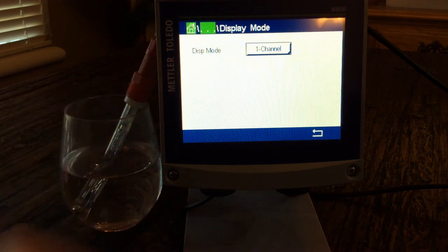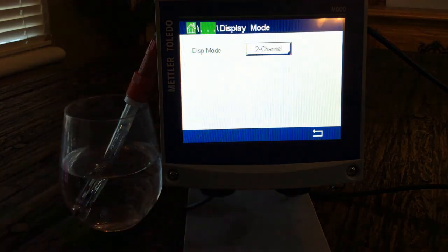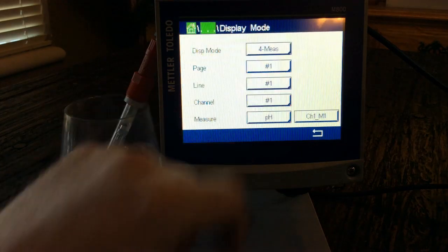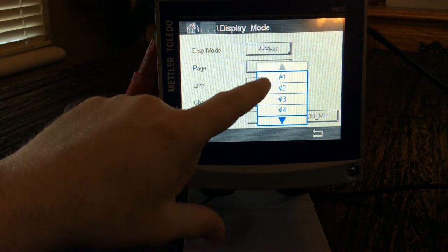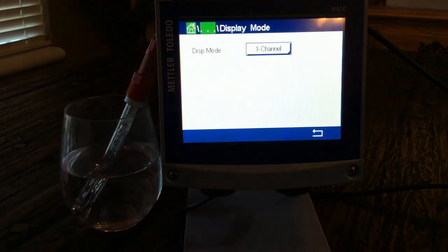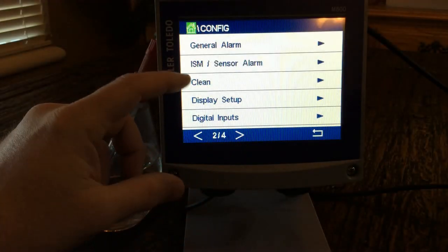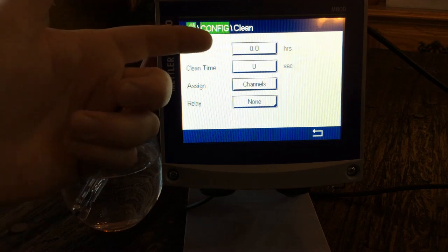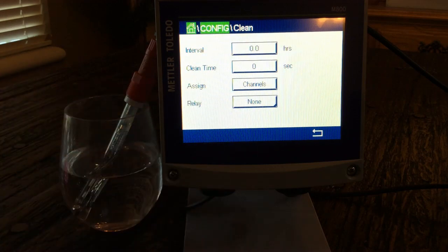Under display setup, I have it set for one channel at a time. If you have a two-channel setup, you can see both channels simultaneously. With four channels, you can assign pH from each channel to display at once — page one, line one, channel one — and select pH for each. For cleaning systems, you can set up cleaning intervals, such as every eight hours clean for 30 seconds, assigned to whatever channel you need.